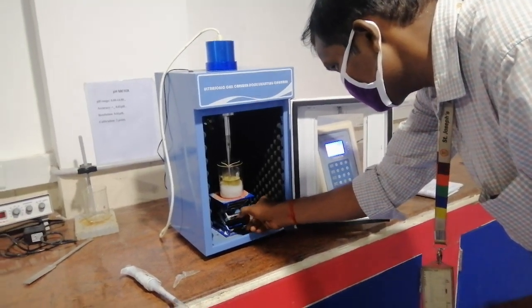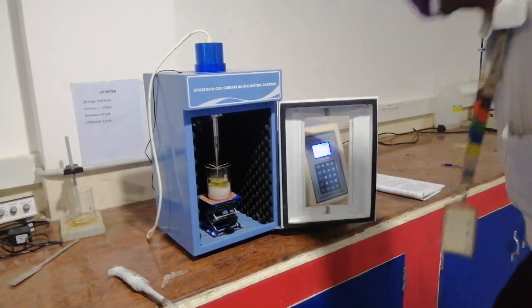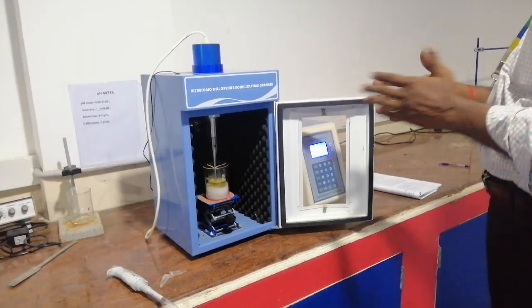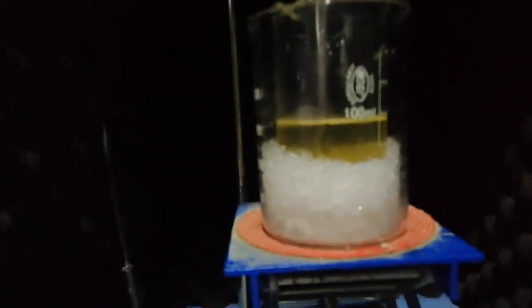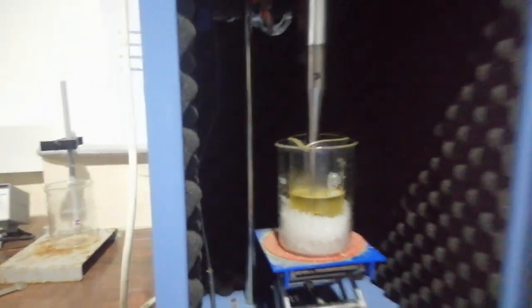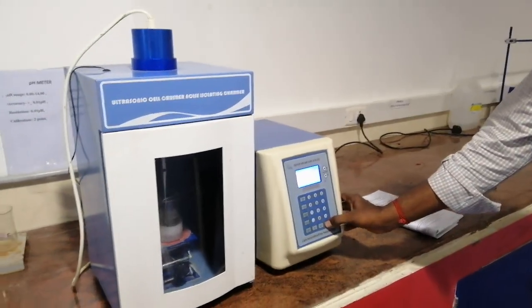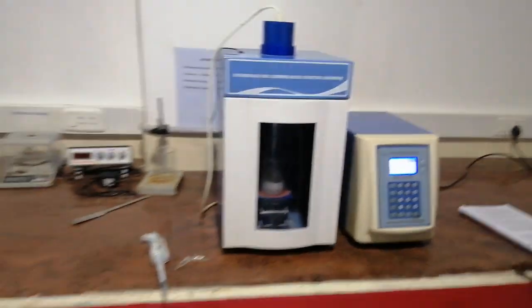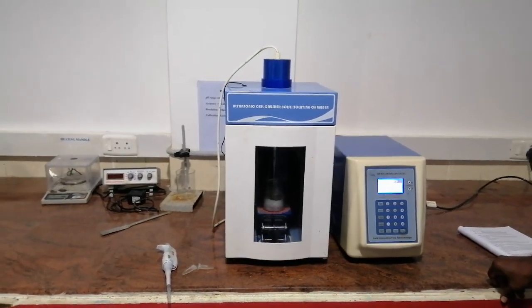When it is touching the side wall or bottom of the beaker, then due to these ultrasonic waves, your beaker will get vibrated and it may break. So then we have kept the sample for the second cycle. Now close it, and then switch on the setup for the second cycle. Now it will go for another 30 seconds. So the total time is 60 seconds.